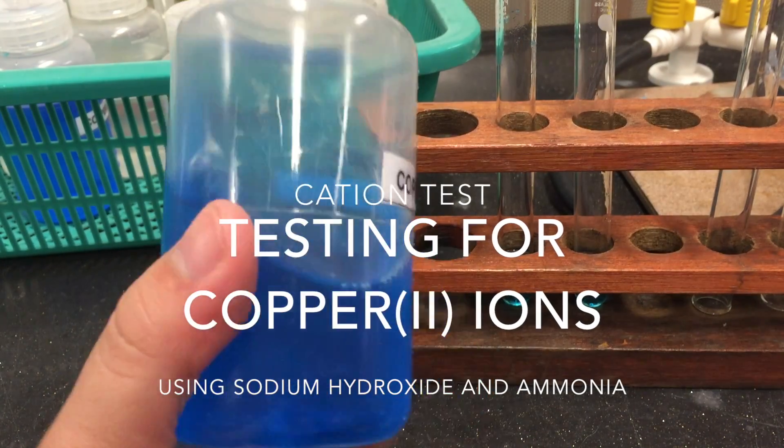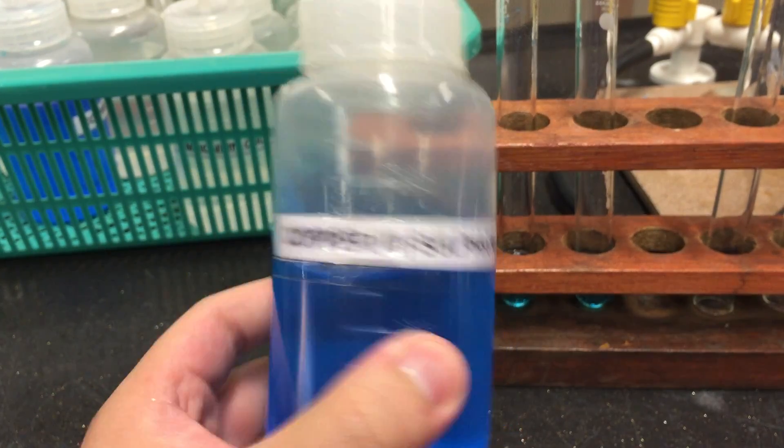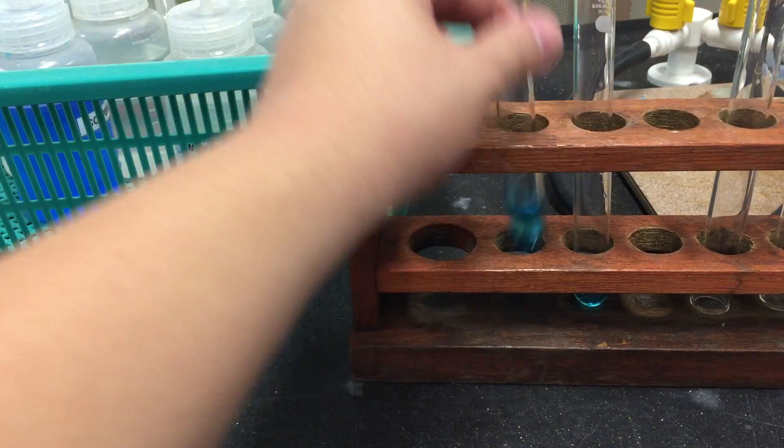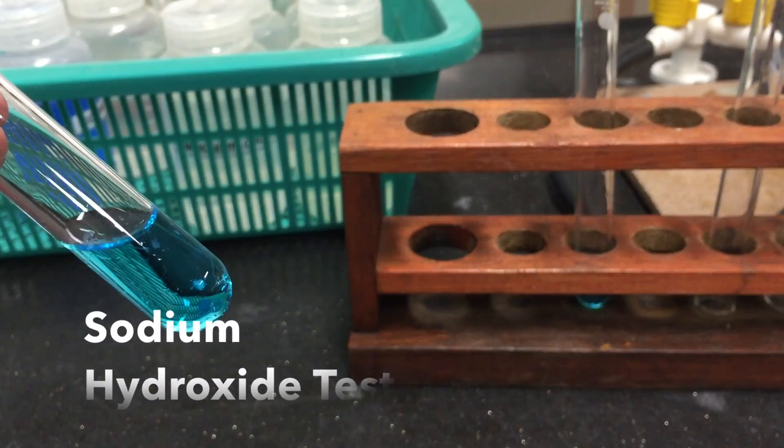Solutions containing copper ions are usually blue in color. To test for copper ions, one of the tests we can use is the sodium hydroxide test.